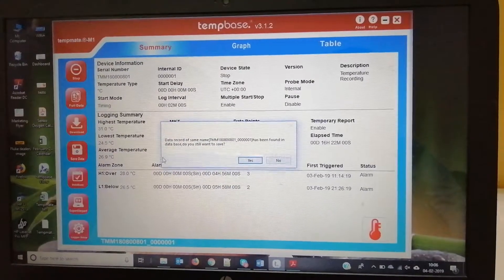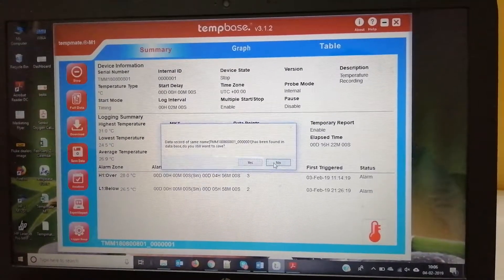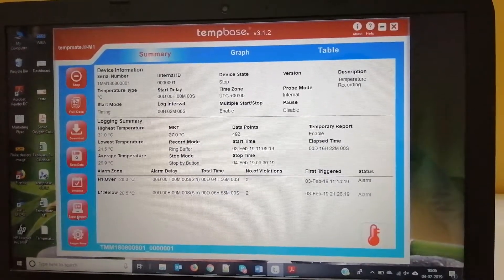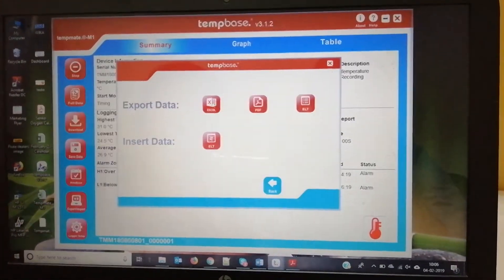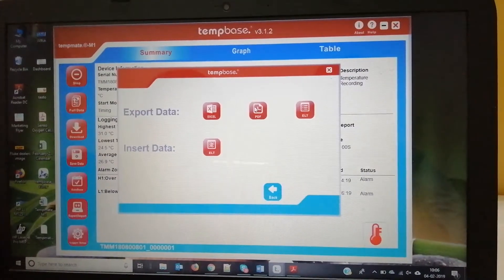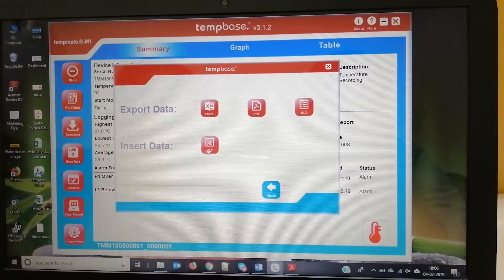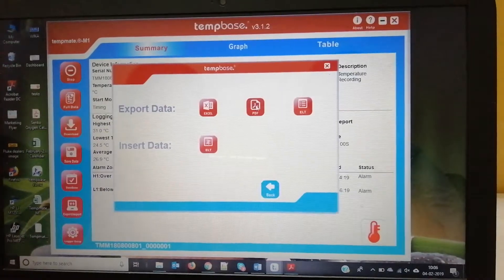I have previously saved the data so I am not saving it again. You can export the data in three ways: Excel format, PDF format, and ELT format. You can also import data in ELT format.